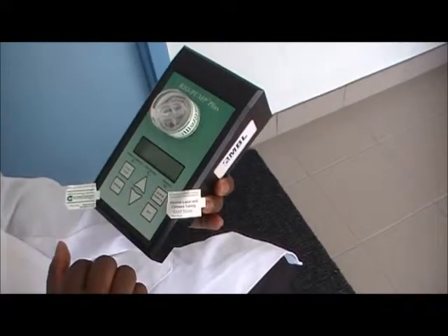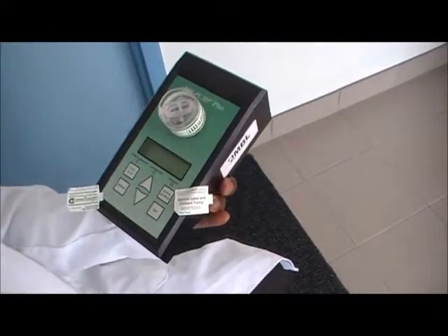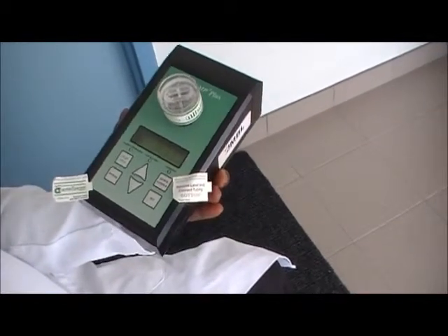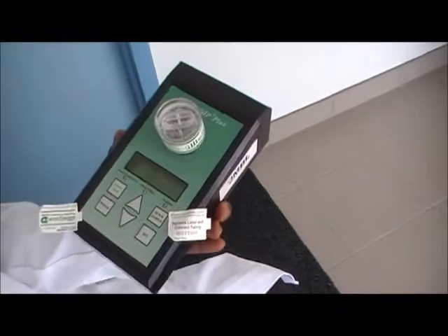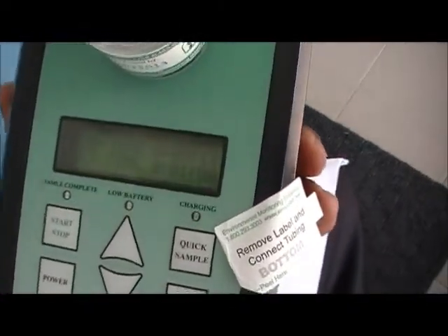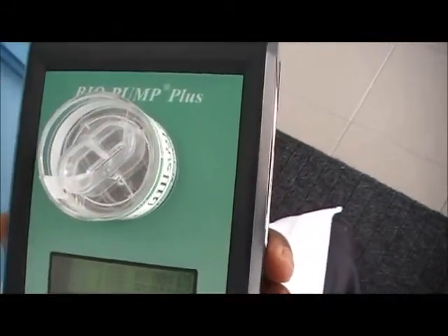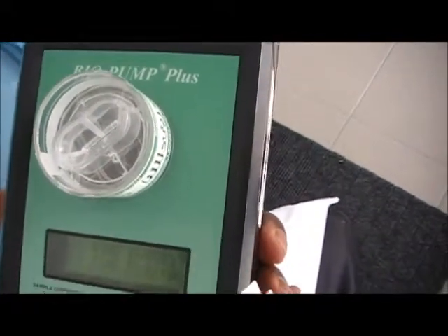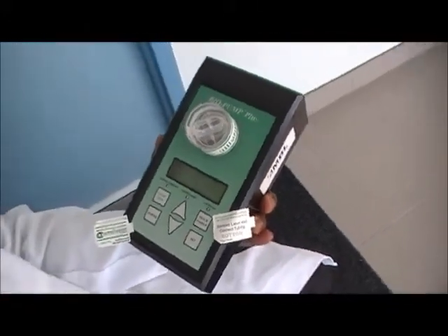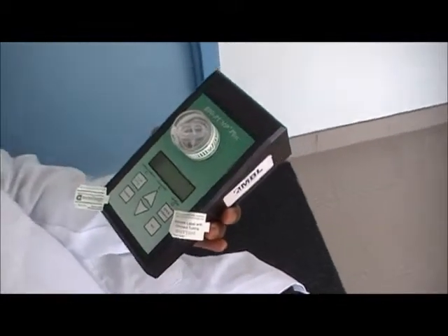After you have set your time, the next thing is just to press the start button. The pump is now actually taking the sample — you can hear that sound. After the sample is taken, the pump will just stop by itself.